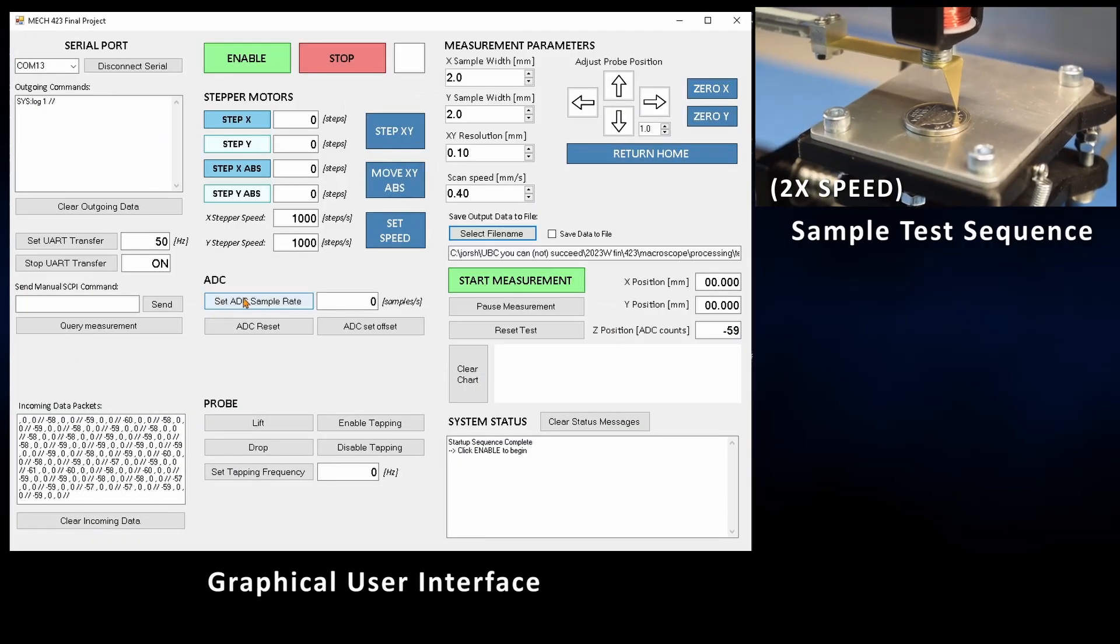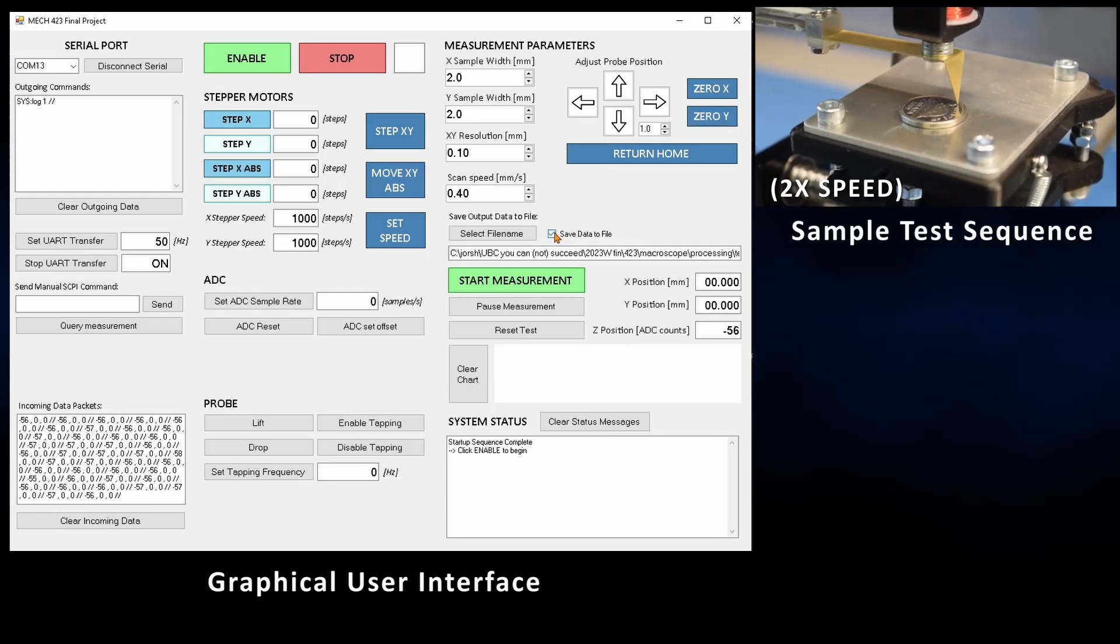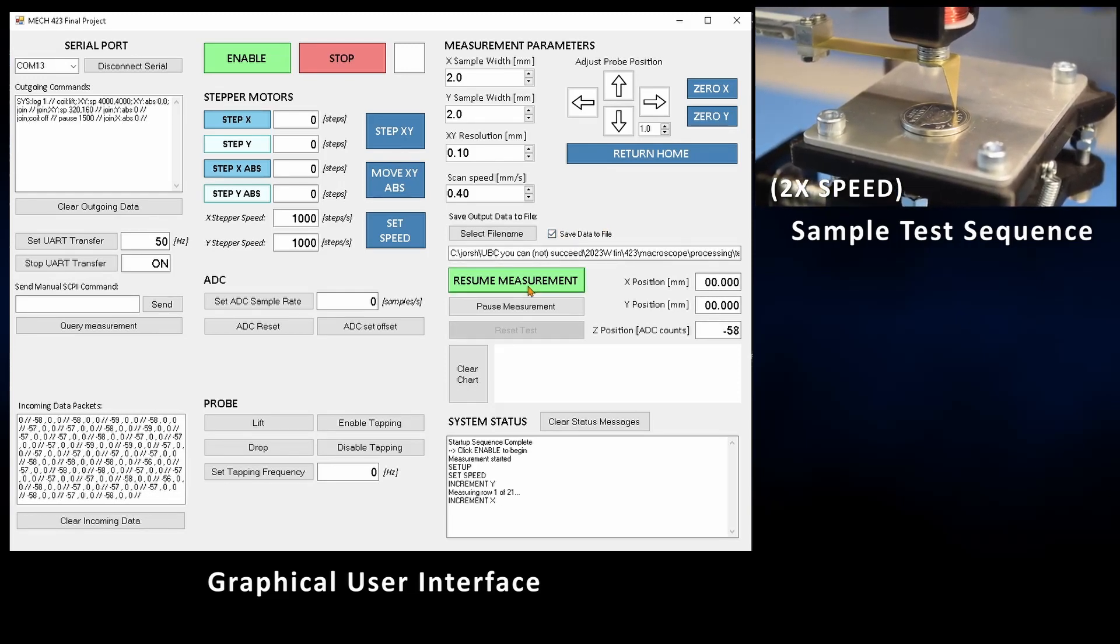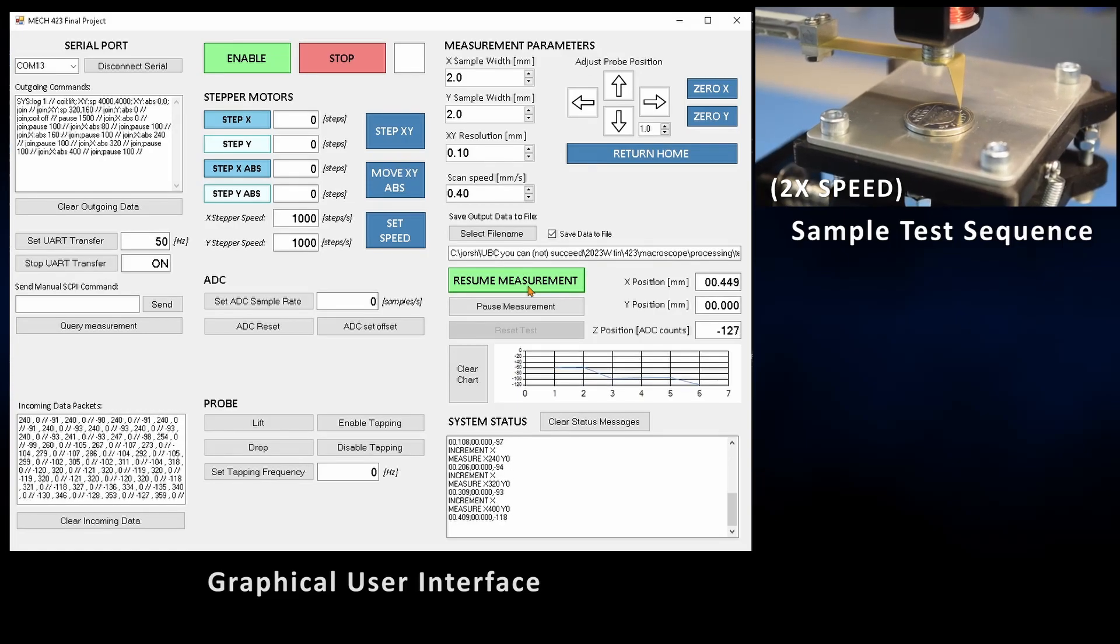A WinForms GUI allows the user to monitor incoming and outgoing data, manually test subsystems of the machine, configure scan parameters such as sample size and resolution, and run the automated scanning sequence.